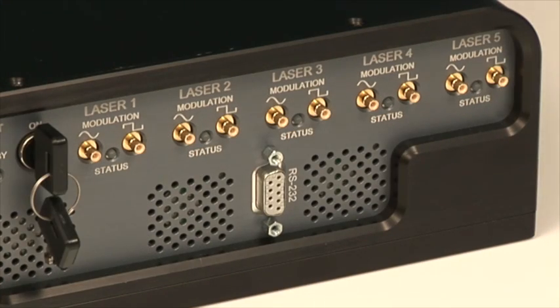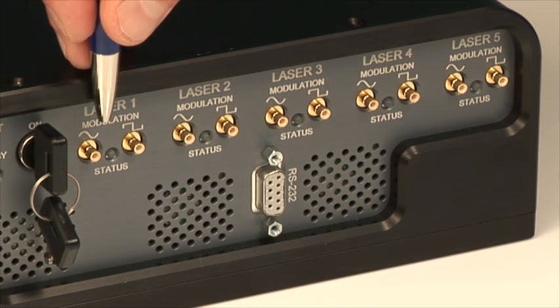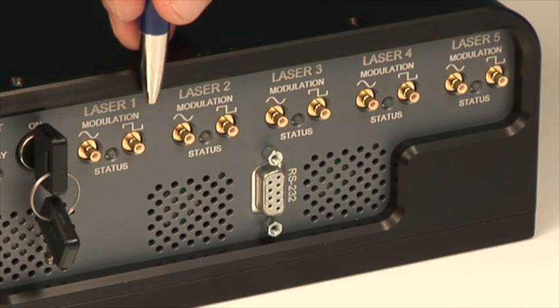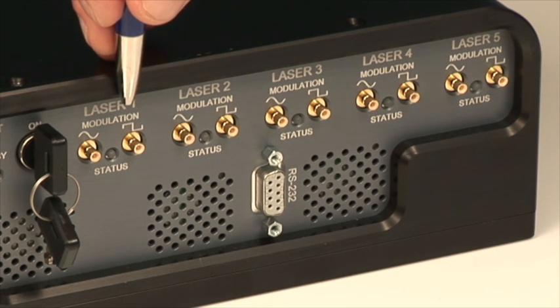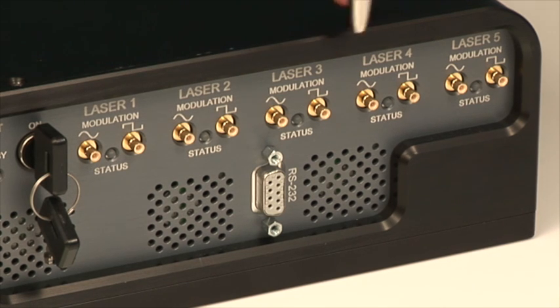Each of the five lasers has separate analog and digital modulation inputs — analog on the left on a SMB connector, digital on the right on a SMB connector. There is a status indicator for each separate laser that can tell you if the laser is on or off, in standby mode, or has a fault. Each laser has separate inputs that can be run asynchronously from each other for complete digital and analog modulation control.